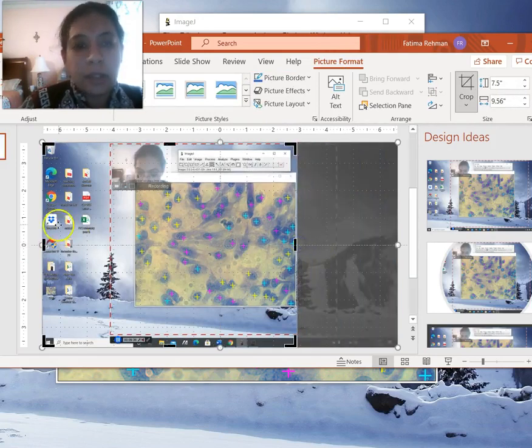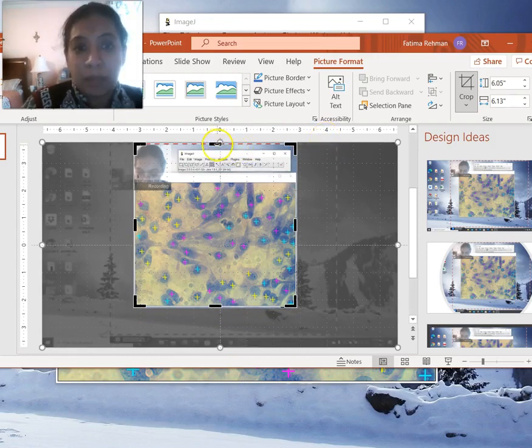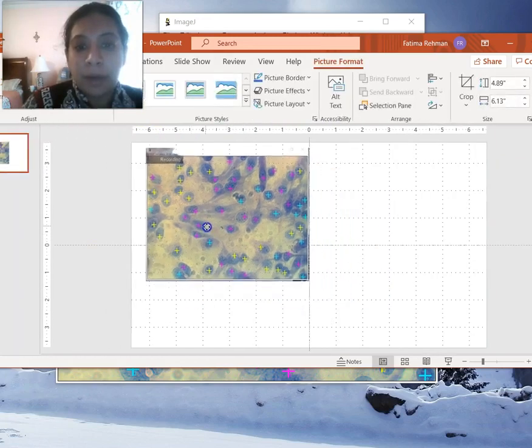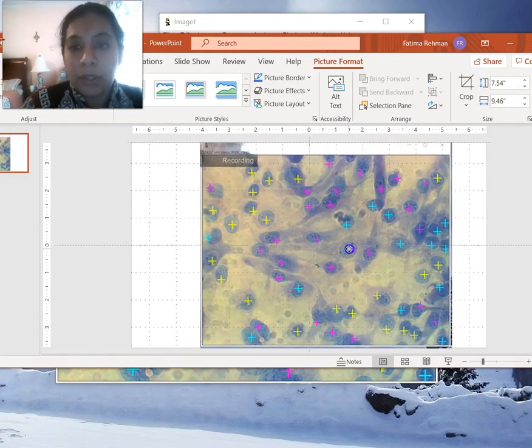Sometimes it's easier to do that simply because the images that are taken through print screen are less bulky. Imager usually gives a really bulky file otherwise, and so it can cause storage issues for some people on their devices, but having a print screen image is usually less bulky. It's not as high resolution, but it provides all the information that you need.